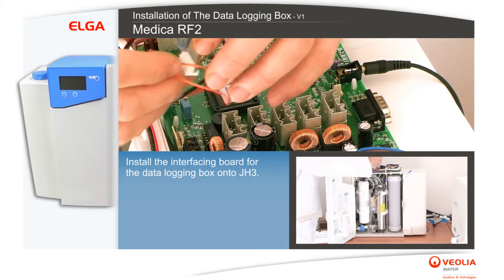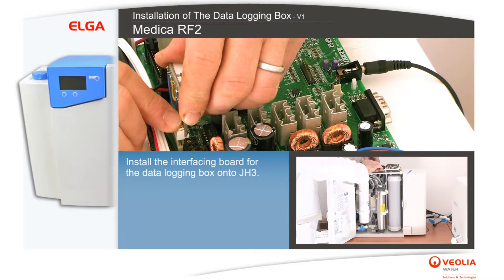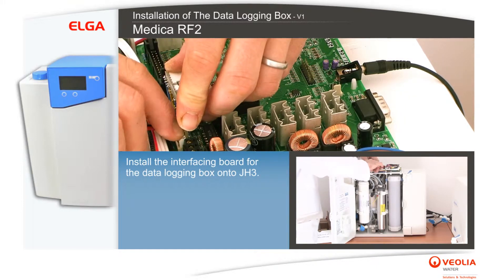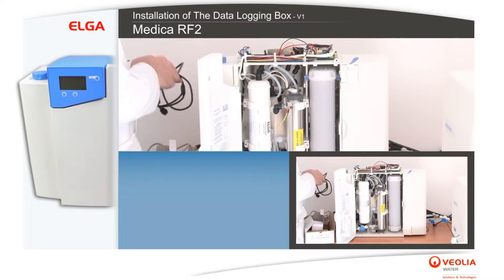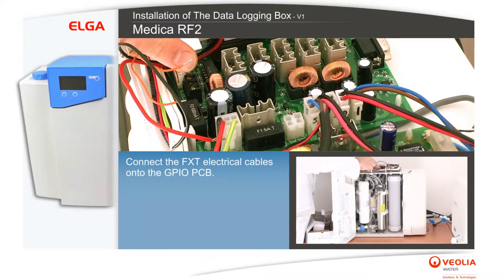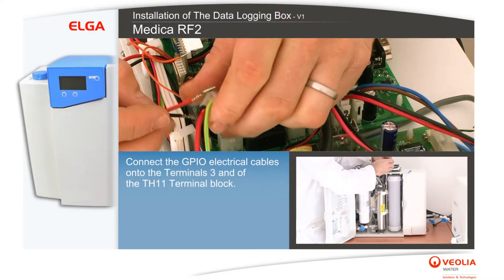Install the interfacing board for the data logging box onto JH3. Connect the FXT electrical cables onto the GPIO PCB, then connect the GPIO electrical cables onto terminals 3 of the TH11 terminal block.